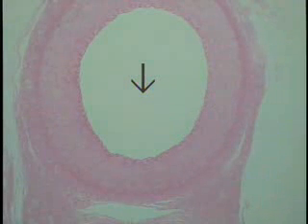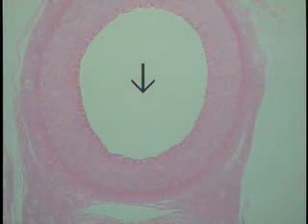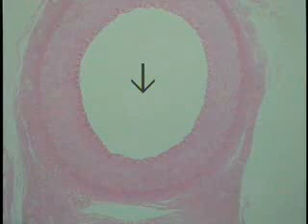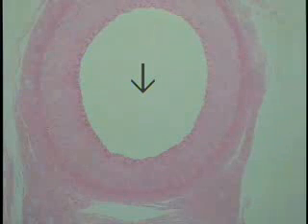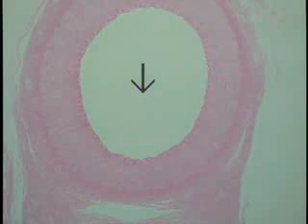So now let's go and examine these particular vessels at increased magnification. This is a hematoxylin and eosin preparation, another one of the plastic preparations to show what a routine preparation will look like. Then we'll compare this with one that's stained for elastin and look at the very same features.